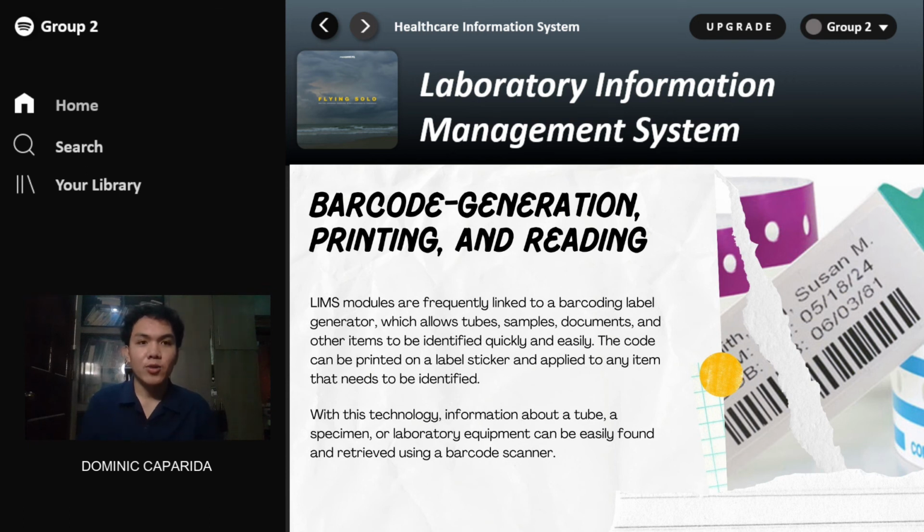These barcodes will be used in case of emergency, like when there is a mixture of test tubes of blood samples that were interchanged, or the samples of a patient are missing. This can happen in a hospital setting. And this barcode literally helps: if you scan it with a barcode scanner, it automatically presents the personal information of who these samples really belong to.